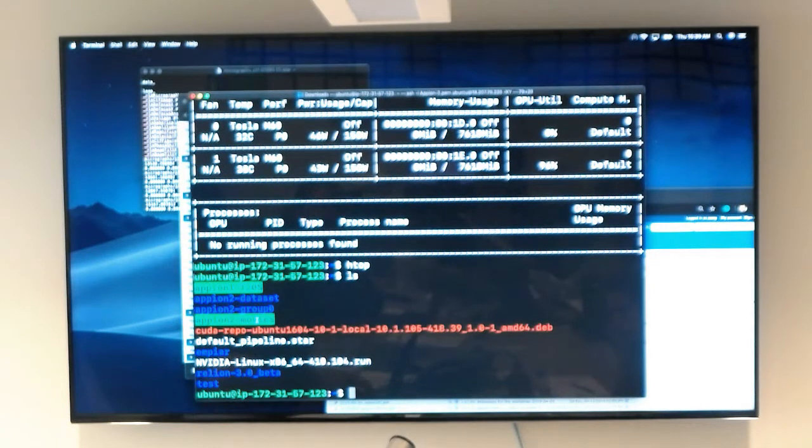For people that are a little bit more advanced and have moved forward, we actually do have movie stacks. So if you wanted to try other features of RELION, like frame alignment, we have that. And we have a T20S EMPIAR dataset. This is 10025.